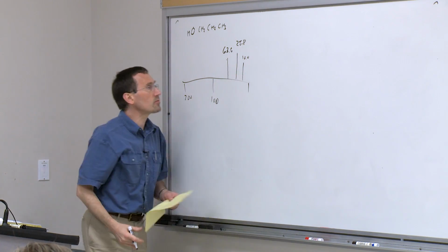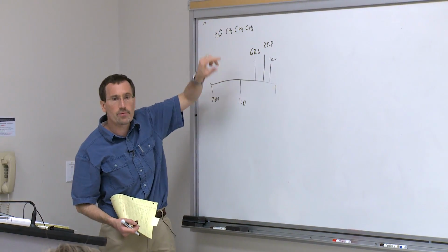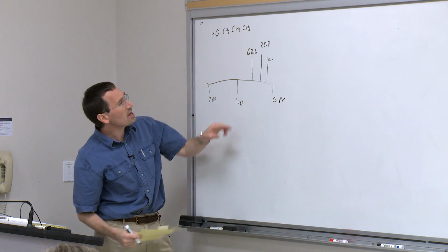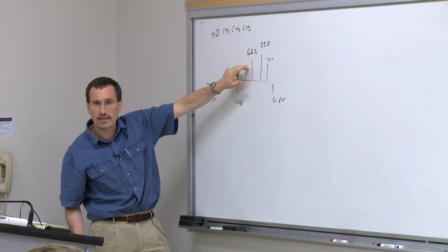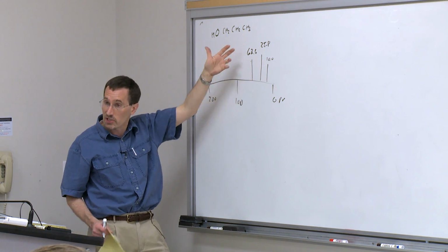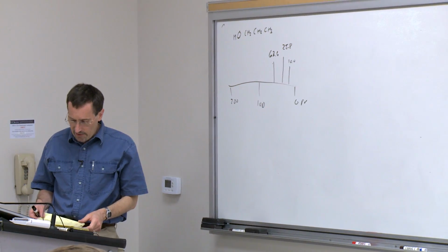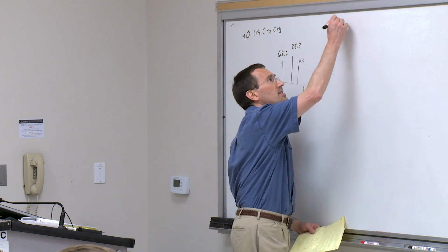And so if I were reading this spectrum, not knowing I had propanol, the first thing I'd be looking at here, and again, this is on the ppm range, I'd say, oh yeah, of course there's some aliphatic stuff, but then there's some carbon that's standing out, and I'd be thinking, oh yeah, maybe a carbon next to an oxygen or a heteroatom. So that's one thing you can do with C13 NMR. Another thing that's very valuable about C13 NMR is you can often pick up on symmetry.